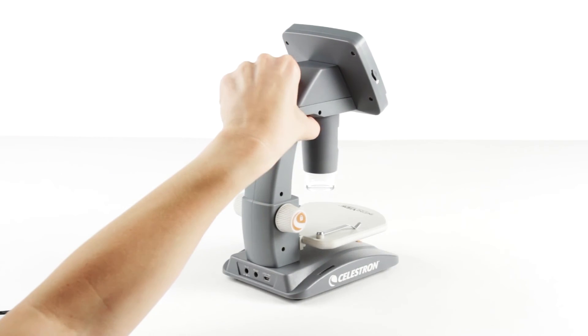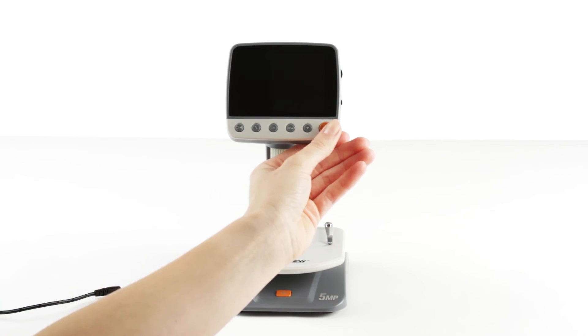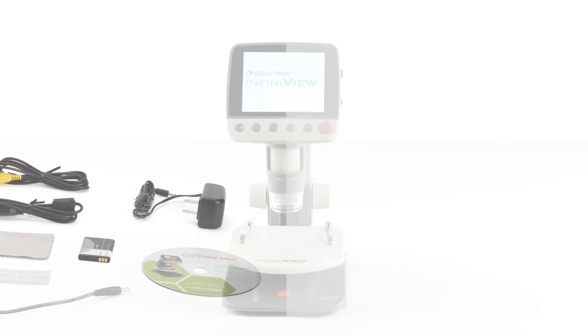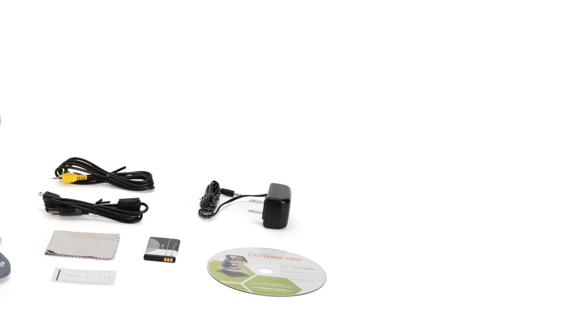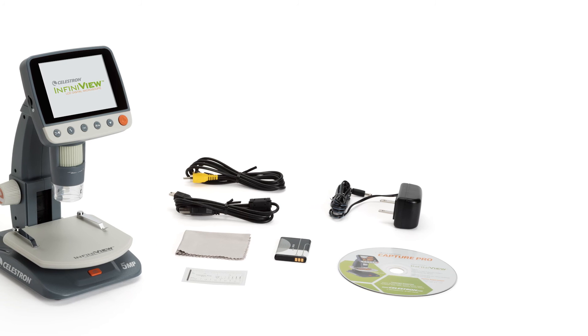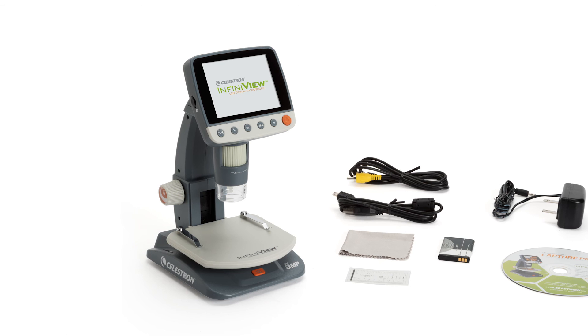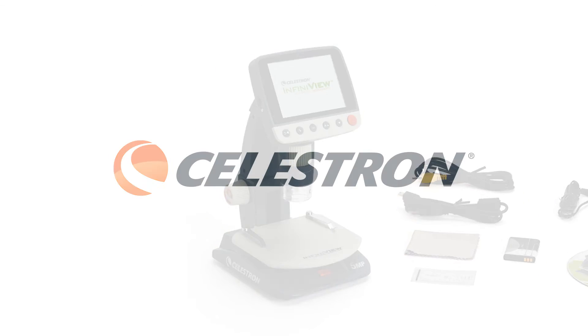This versatile microscope can go anywhere you do. InfiniVue runs on a rechargeable lithium-ion battery for up to 3 hours in the field. InfiniVue includes a CD-DVD with Portable Capture Pro software and full instruction manual, a lens cleaning cloth, calibration ruler, USB cable, video out cable, and AC adapter.